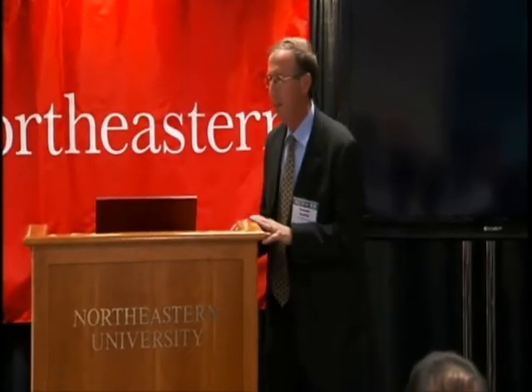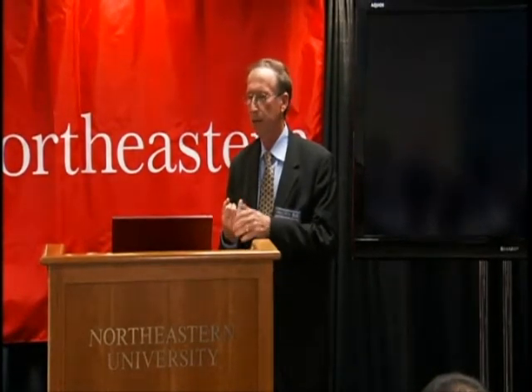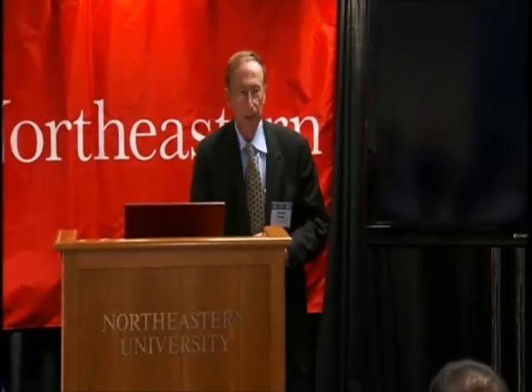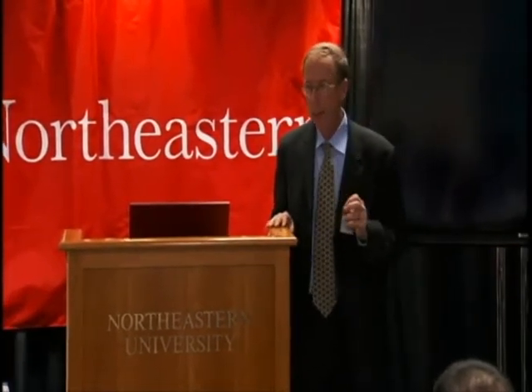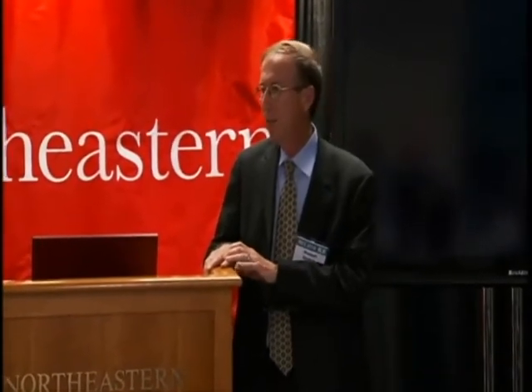But to be successful, it's not just the ability to detect these molecules. It's the cost, it's the regulatory path, and it's the performance. So what are some of the issues to think about? The first one I would say is the technical issues. You have to have a very clean sample, and Roger just showed us ways to get to the sensitivity you need. But these biological samples are very, very difficult to deal with, and there are tremendous opportunities from an engineering and biology perspective to make them cleaner and better. You make the samples cleaner, you'll get better results with your mass spectrometer.